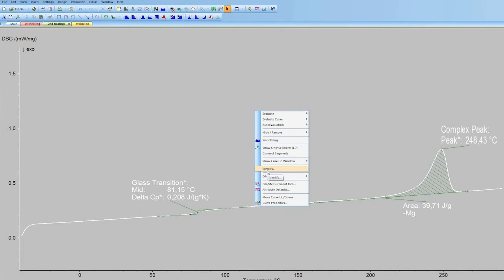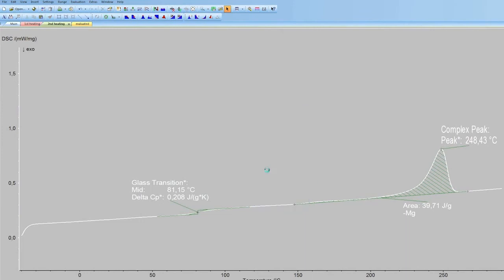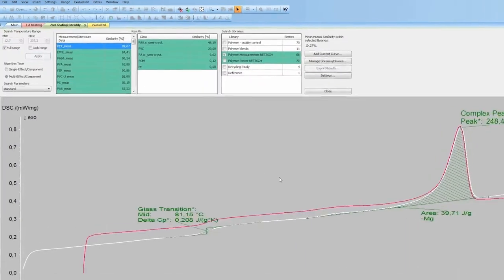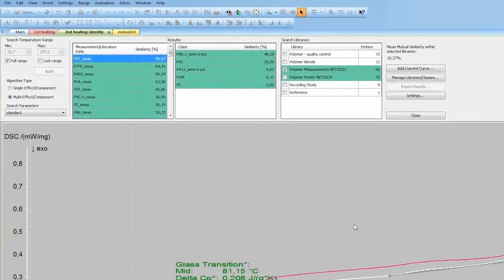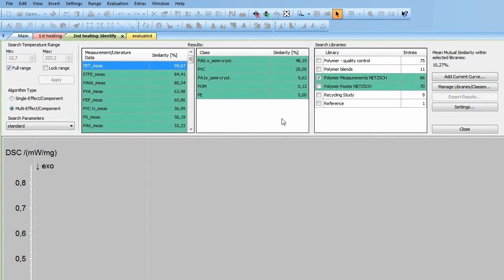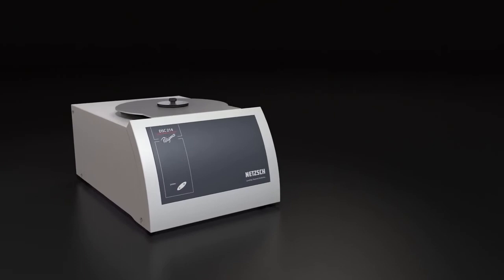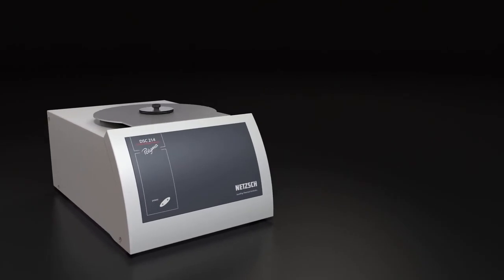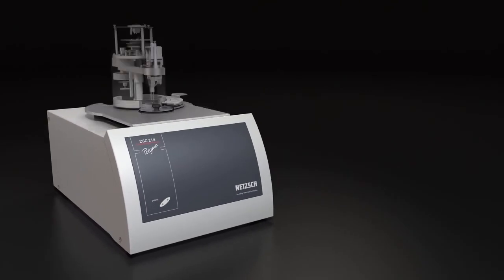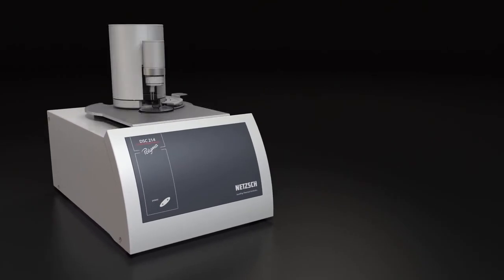Imagine a software that automatically identifies your polymer samples, quick and easy, using built-in NETZSCH databases and your own measurements. Imagine a DSC that fulfills your demands while exceeding your expectations.